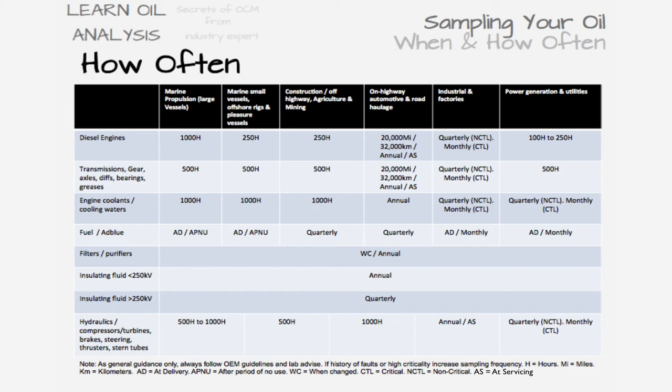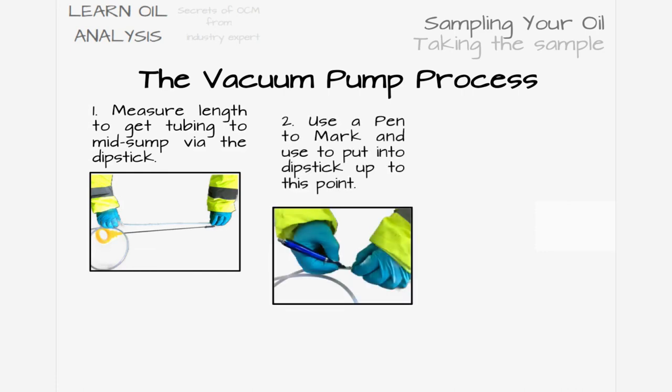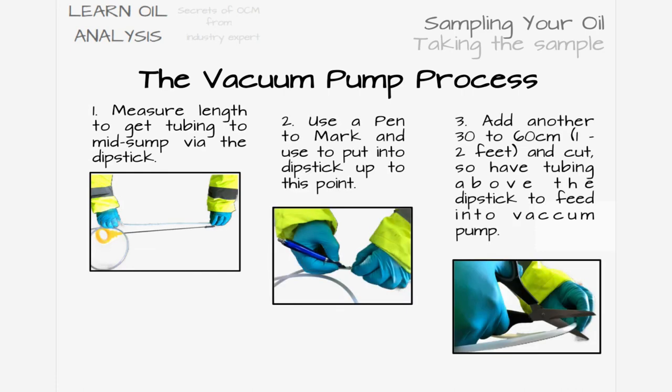We will now move on to how to take a sample using a vacuum pump, using a diesel engine as an example via the dipstick. First, you need to get the tubing to approximately mid-sump. Draw the dipstick out, wipe it clean, measure the tubing length against it, and mark the point to push the tubing to.